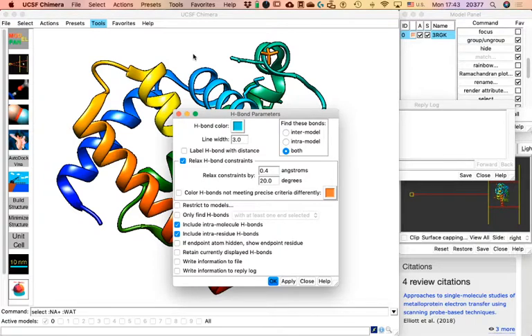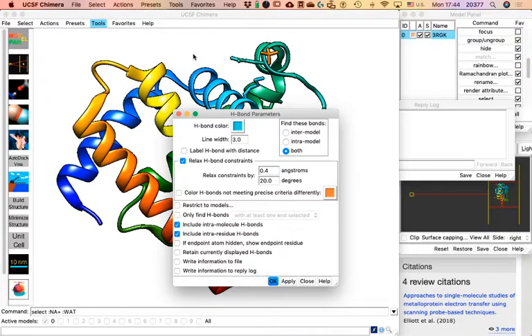We're going to calculate the hydrogen bonds in this structure. Because it's alpha-helical, there are going to be hydrogen bonds in every single piece of secondary structure. Click 'Find Hydrogen Bonds' — you'll get this window. I've changed one parameter: for illustration, every hydrogen bond will be displayed as a blue line with a thickness of 3 points. Yours should read 1.